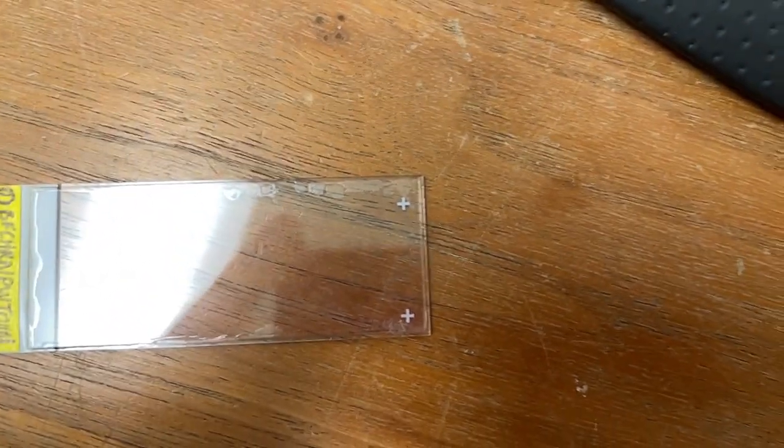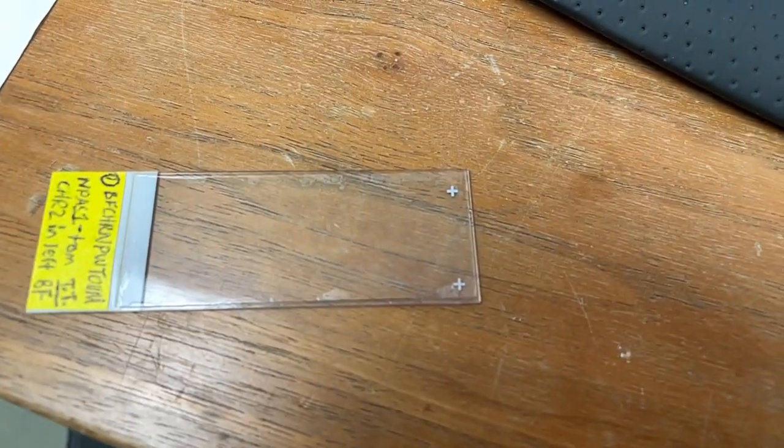This is BF, ends in a 12 and an M. So like this, it's kind of hard to tell. You can see on the edges the mounting media is starting to pull away a little bit.